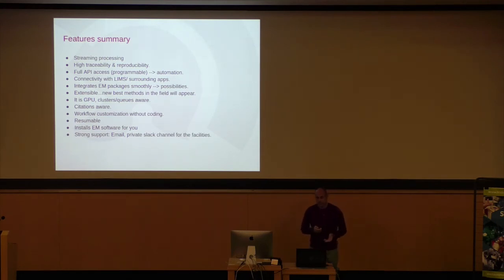You can interact with LIMS systems. It integrates many EM packages smoothly, which gives you lots of possibilities. And it's extensible, which means anyone at some point can develop a plugin, mainly developers of their methods, and then that method could reach your installation.